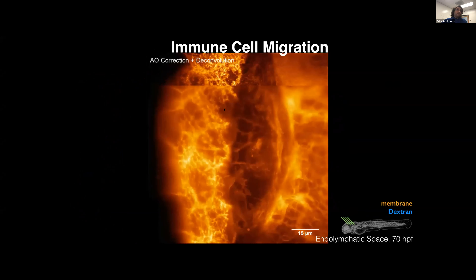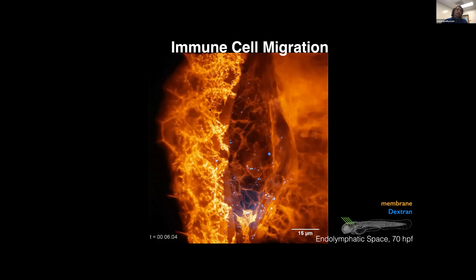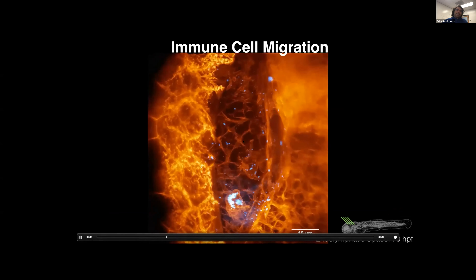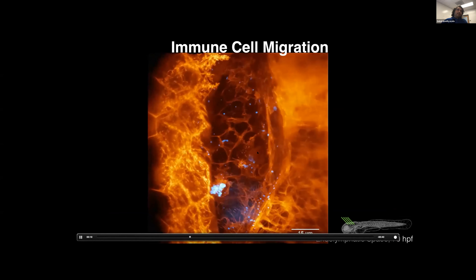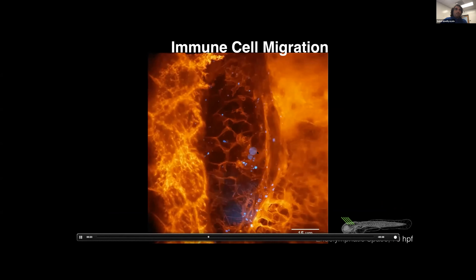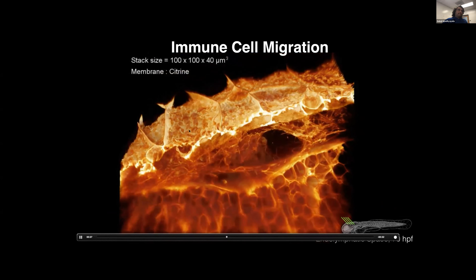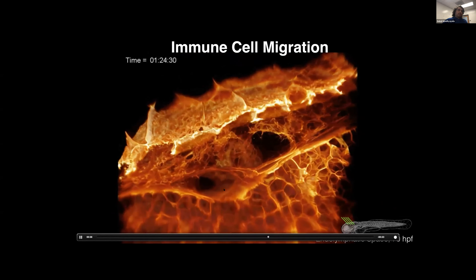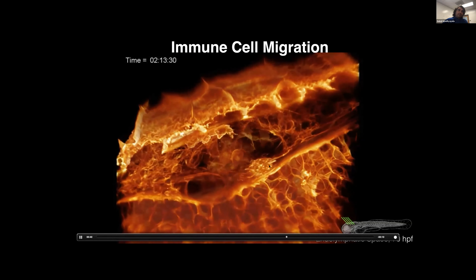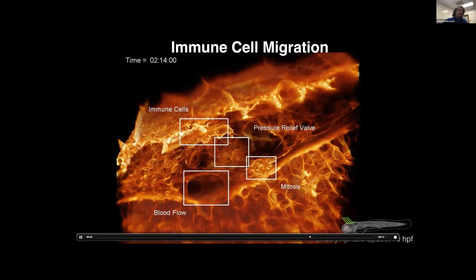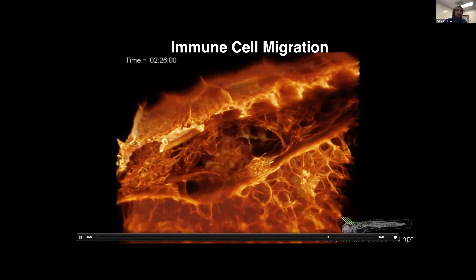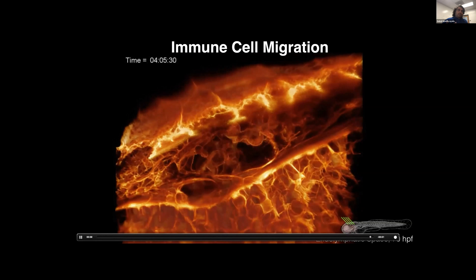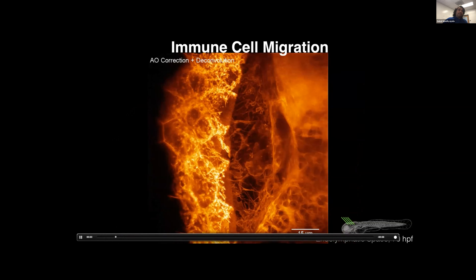In one field of view imaging the ear region of the zebrafish, we studied the endolymphatic duct and sac regulating pressure as the ear develops. The immense diversity of biology visible in this single volume is striking: ruffling skin cells, the hindbrain, a blood vessel with red blood cells zipping through, endothelial cells, cells in anaphase, immune cells crawling around and sensing their environment — eleven distinct cell types captured in one region of interest.